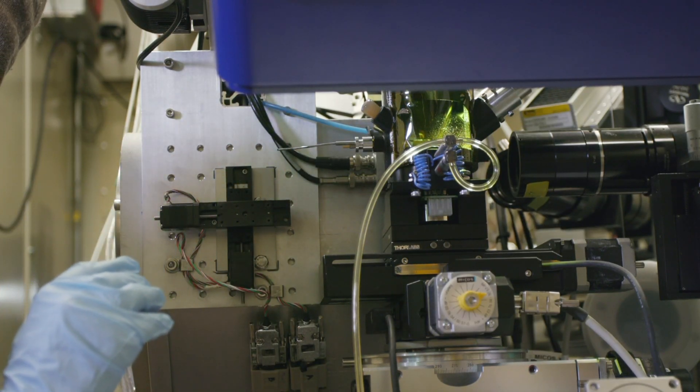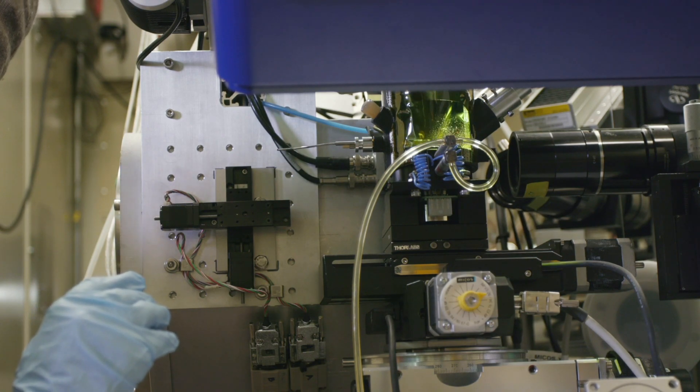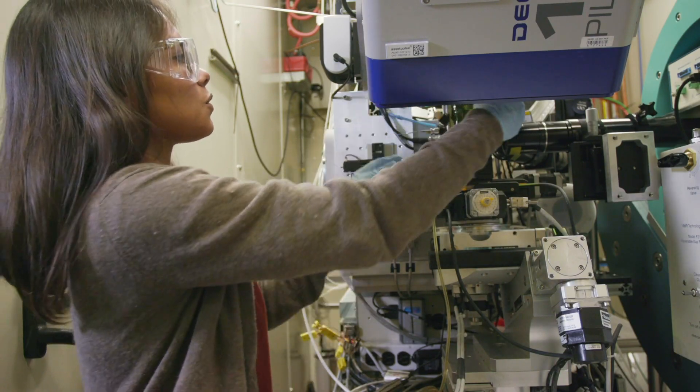For which it is important to use the light from the advanced light source in the form of hard x-rays.